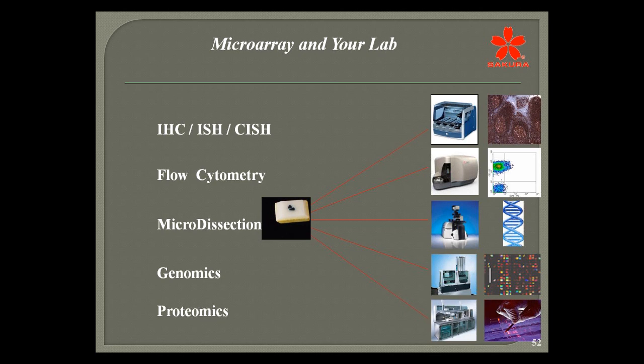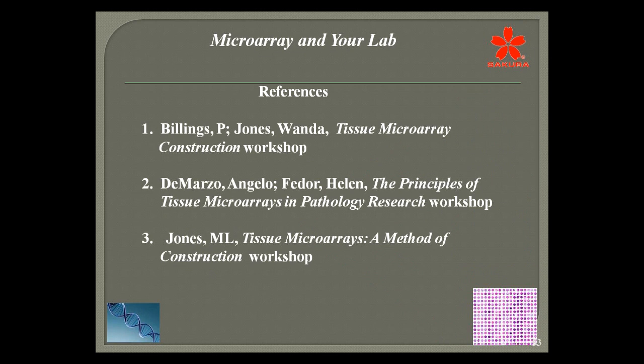That's how it really is now in a lot of institutions. So the molecular world is weaving its way into histotechnology, and we just need to be prepared for it. So I think that microtissue arrays are just a neat beginning point to help give the needs that are required for better testing and assays for patient care.